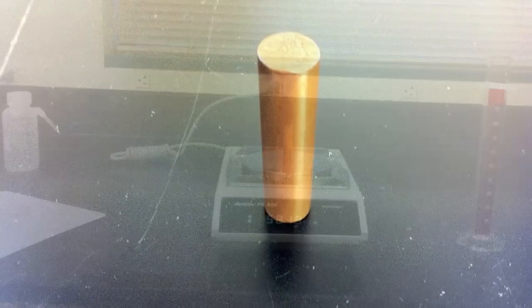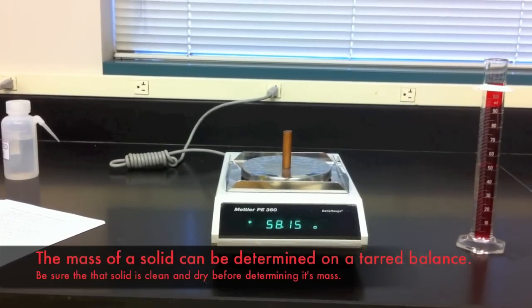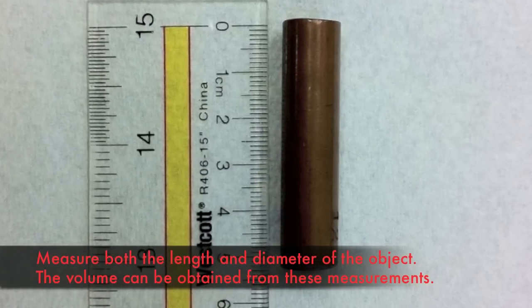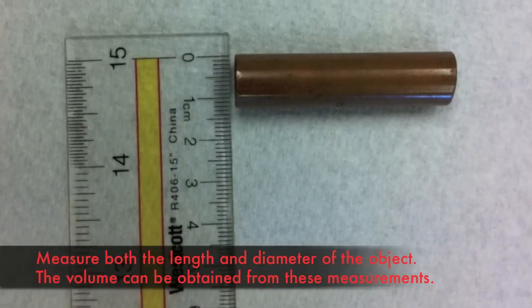Finally you'll determine the density of a solid. The mass of the solid can be measured on a balance. Determining the volume of a solid is significantly more challenging. One approach is to attempt to measure it using a ruler.